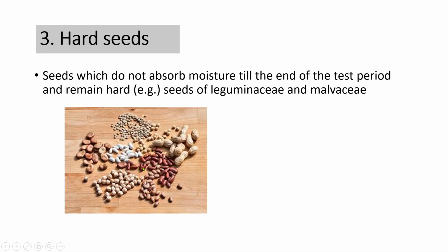Once the seed coat is cracked, seed treatment in these kinds of hard seeds is usually done, and seed germination can be recovered through a process called scarification, which means rubbing or cracking of the seed coat so that a little moisture enters inside the seed coat, and the usual metabolism of growth and development starts right after the moisture entry.